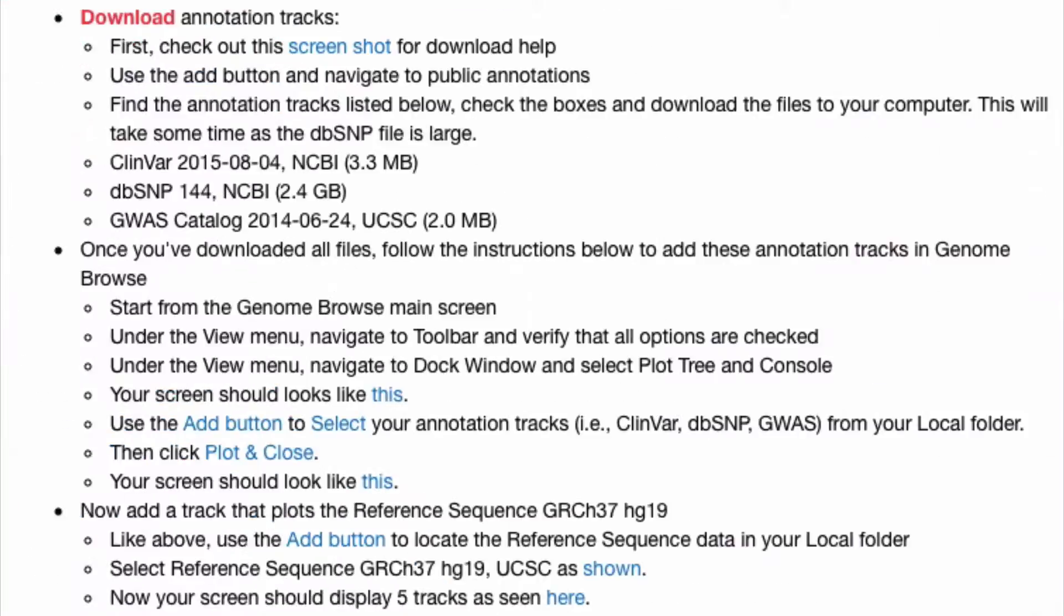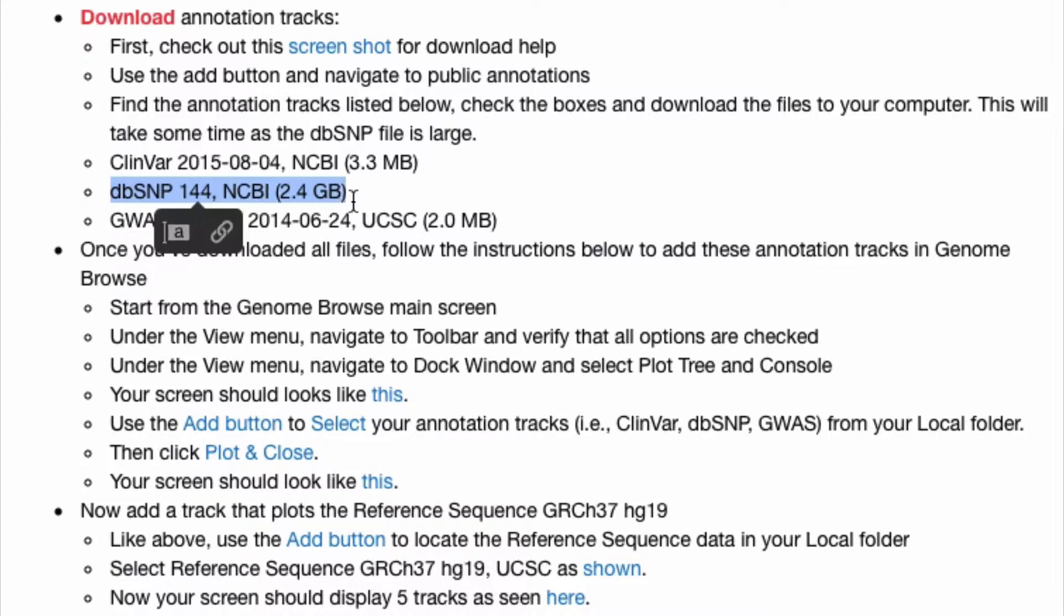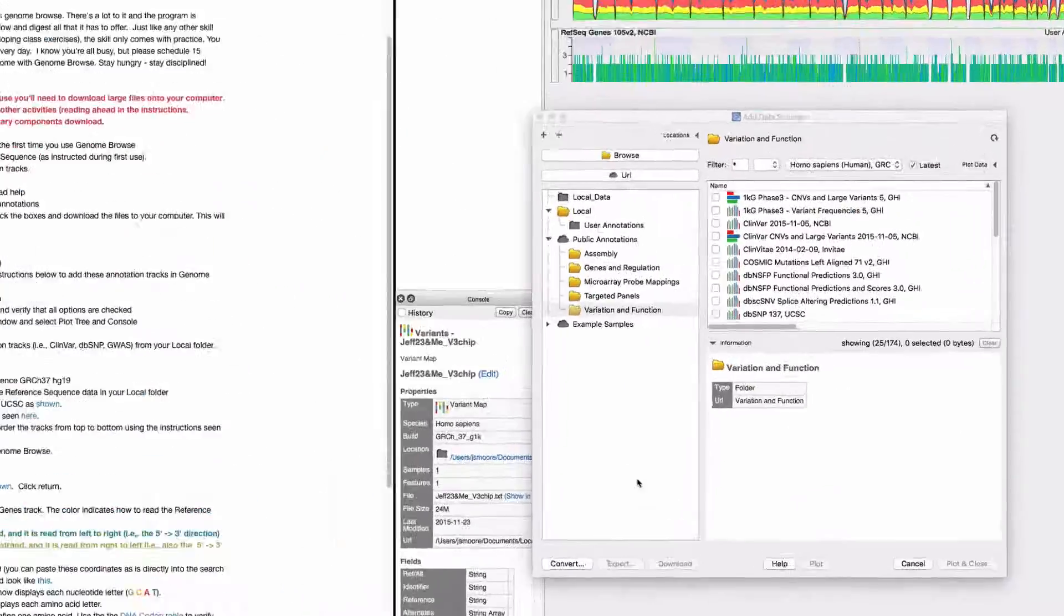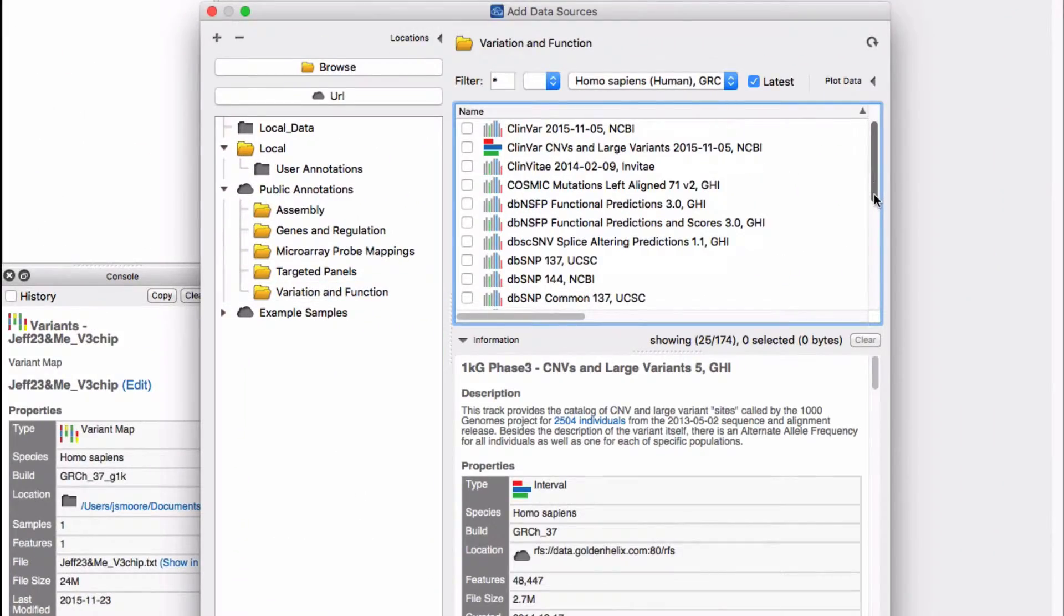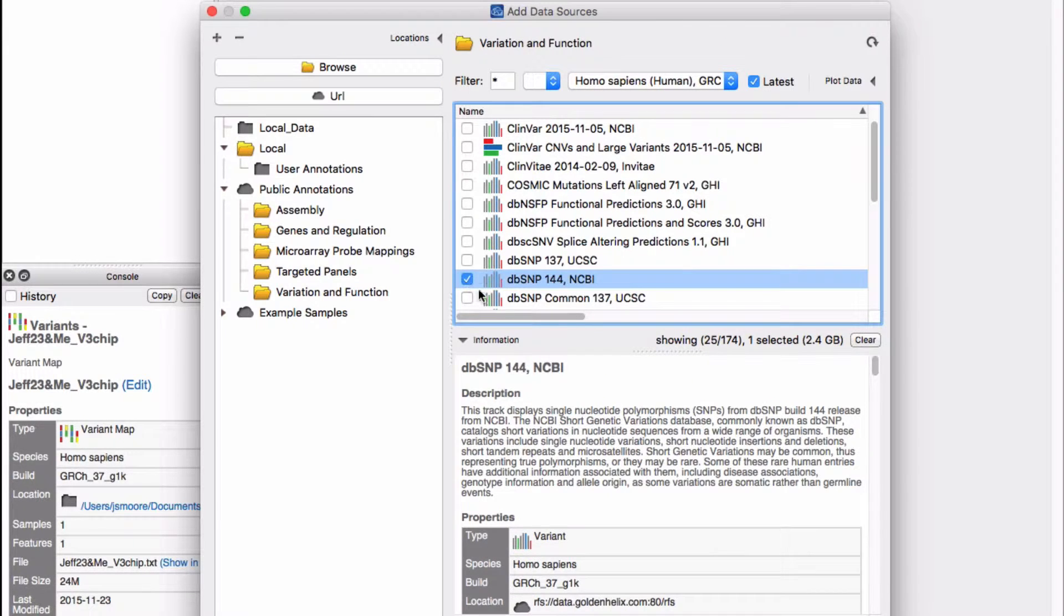My notes point us to DBSNP 144 from NCBI. That's the version of DBSNP we want. After you check the file, you can read a description of the DBSNP 144 annotation.